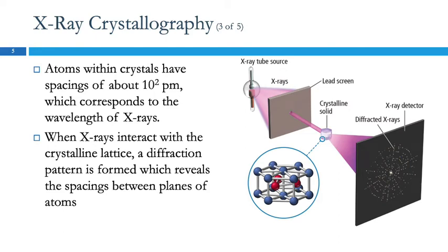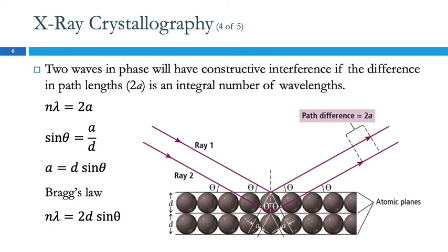The spacing affects the diffraction patterns that are seen. And I'll be flat out honest with you, how they get this and figure out the distances between them, I never learned how to do that. That's just kind of crazy stuff, but they can do that. This part makes sense to me.